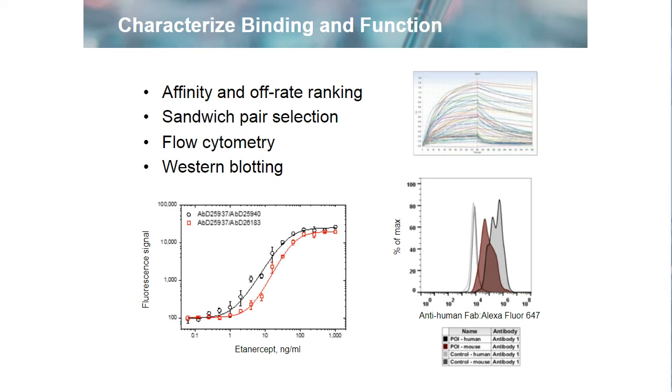Okay, so this brings us to the end of the first 3 ways of controlling our critical antibody reagents that fall under the umbrella of identity. So by building specificity, selecting the appropriate formats, and making sure that they're most likely to work in the intended application. And this is all built into the antibody generation process.